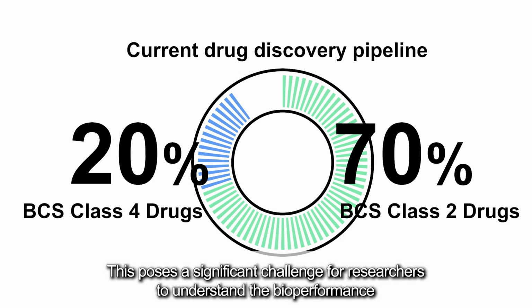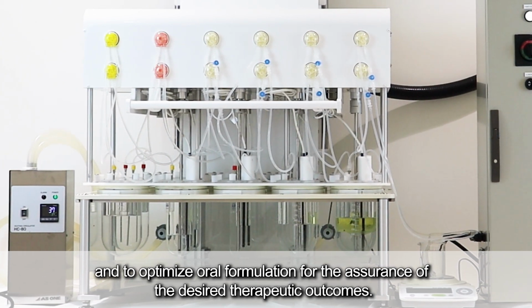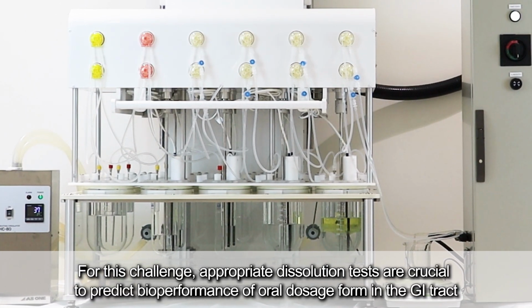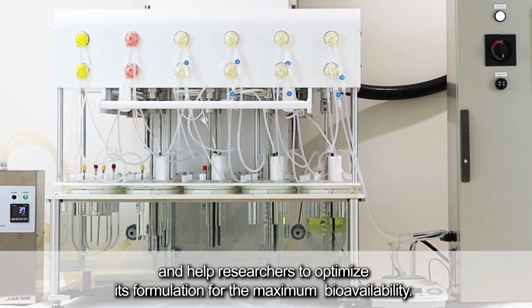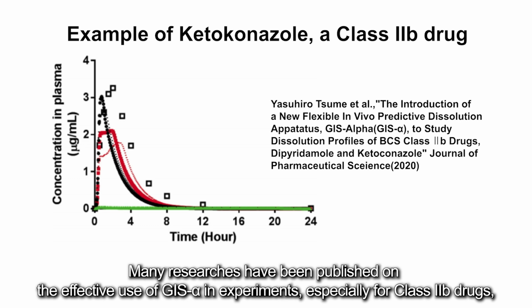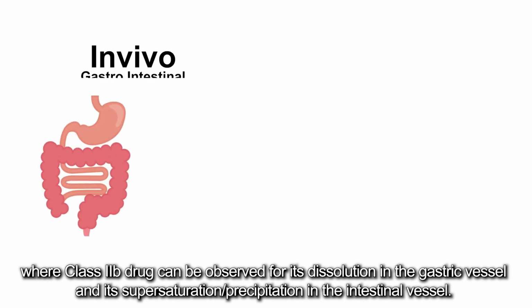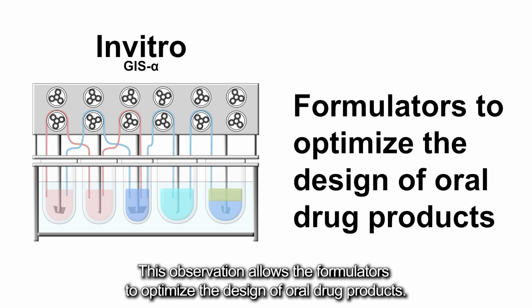This poses a significant challenge for researchers to understand the bioperformance and to optimize oral formulation for the assurance of the desired therapeutic outcomes. For this challenge, appropriate dissolution tests are crucial to predict bioperformance of oral dosage form in the GI tract and help researchers to optimize its formulation for the maximum bioavailability. Many researches have been published on the effective use of GIS-α in experiments, especially for class 2B drugs, where class 2B drug can be observed for its dissolution in the gastric vessel and its supersaturation, precipitation in the intestinal vessel. This observation allows the formulators to optimize the design of oral drug product.